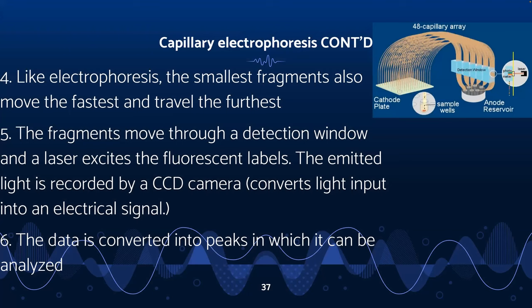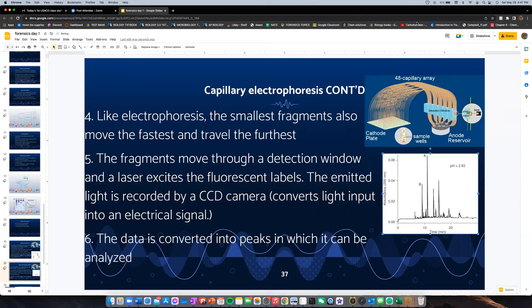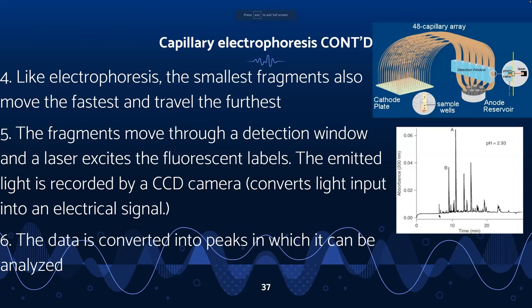I didn't put a picture of capillary electrophoresis, so I'm just going to pull one up from Google, because it actually looks very different from gel electrophoresis. That didn't work. Okay, there, that's what capillary electrophoresis looks like, where there are peaks that you can view.